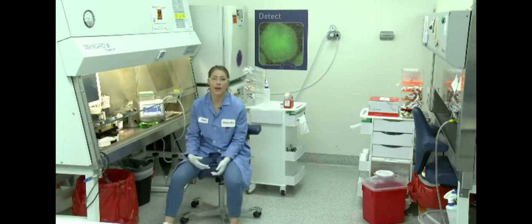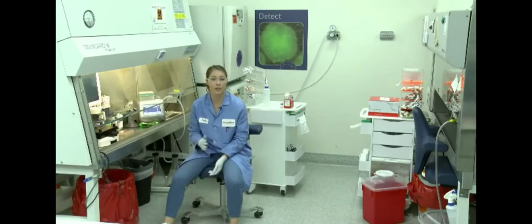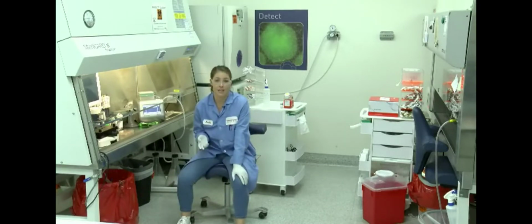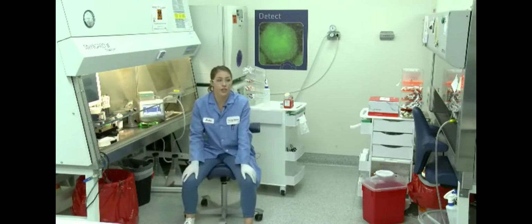In the case of genome editing, you can do a genomic cleavage detection assay. This is where you'll PCR your targeted region, and then you will denature and reanneal your PCR product. If you have genome editing, this will create mismatches, and then you can introduce a detection enzyme which will cleave where the mismatches have occurred. I've prepared a slide which shows a GCD assay after genome editing using HPRT guides.